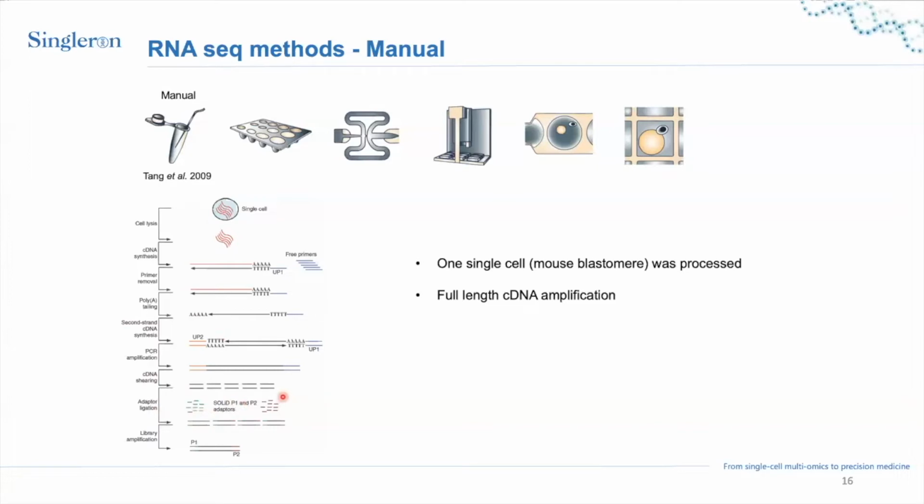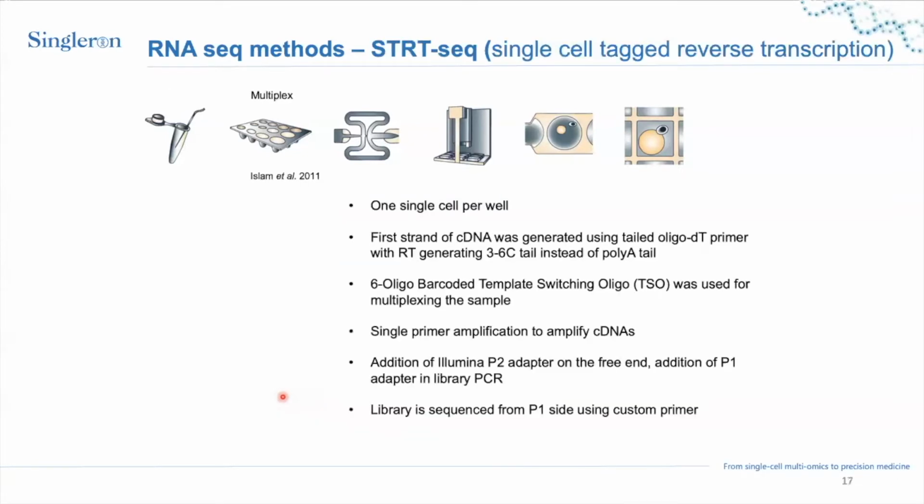They used full-length cDNA amplification for this process. It was only one cell, so it was a proof of concept experiment, basically.